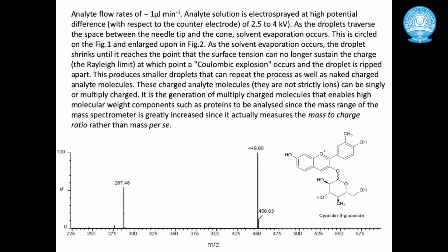So it is essential to have more than one peak in mass spectrometry. Every peak should not be a single clean peak. There should be at least more than one peak, which will account for the isotopes of the atoms present in the compound.